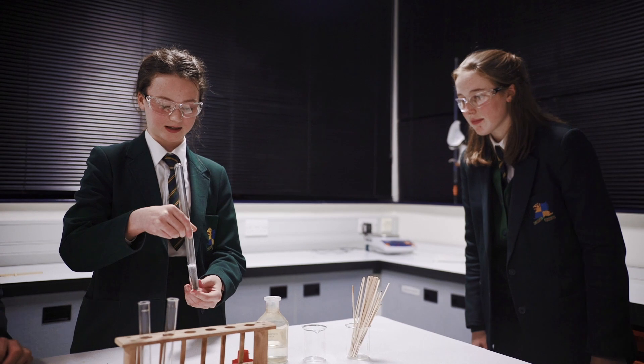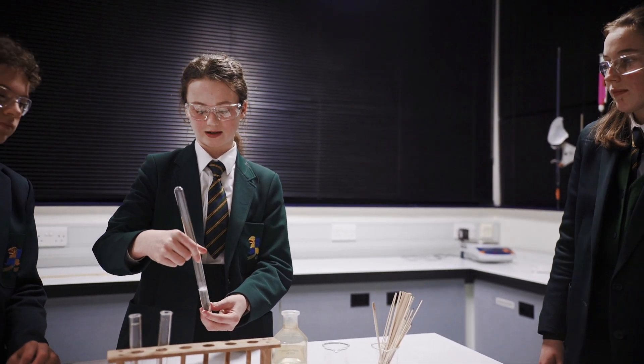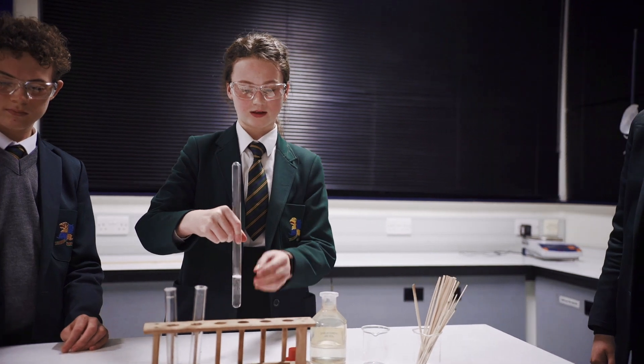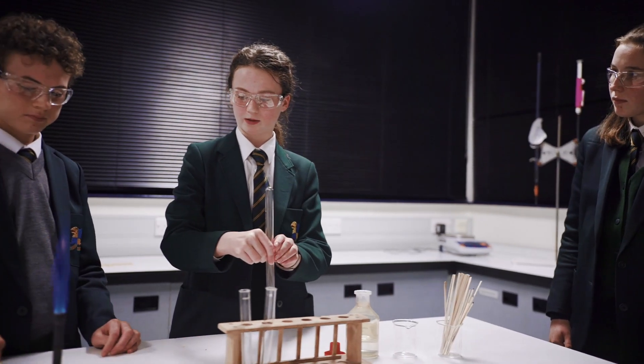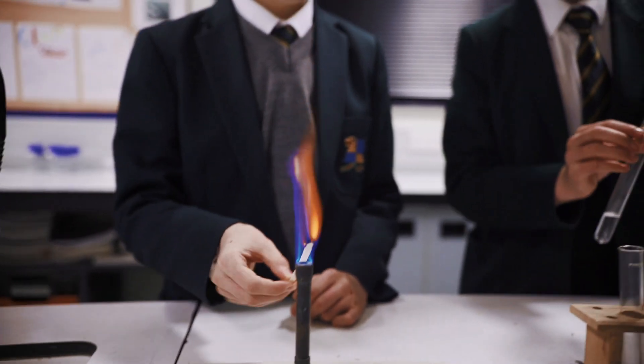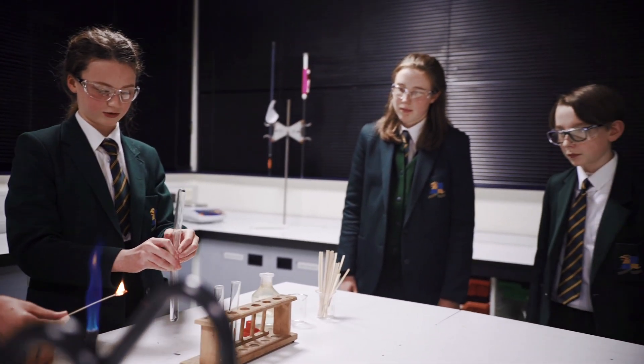We've got some hydrochloric acid and we've put in a magnesium ribbon and it's just fizzing — it will eventually disappear. The gas from that is rising to the top and will be collected. Then we're going to light a splint and it shoots it off.